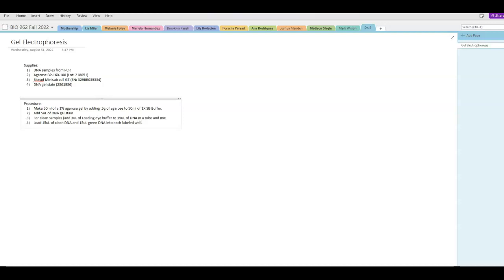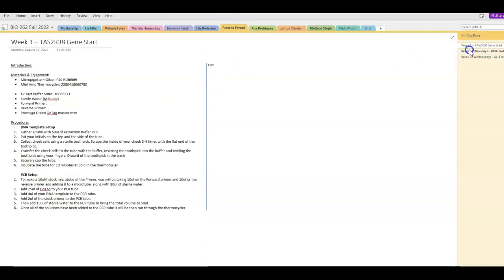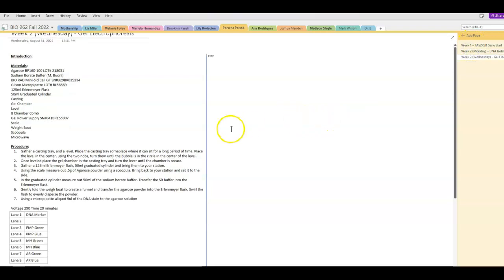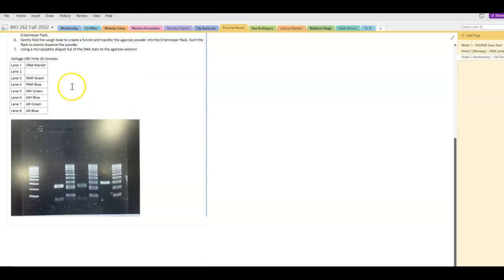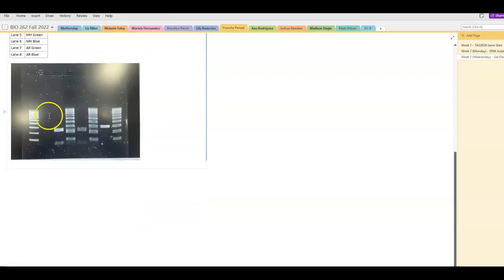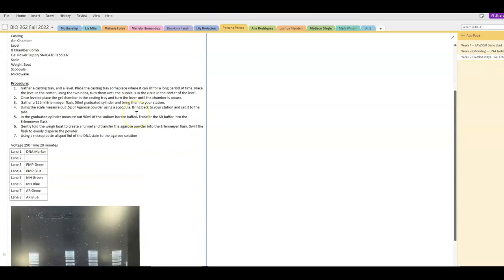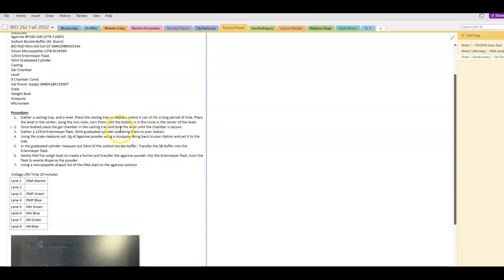What I'm then going to do is show you what I could do from there. I'm going to use Portia. Portia already went ahead here and had all of her stuff in order and did this today. So you can see that Portia not only went into way more detail than I did, and that's totally fine, I wanted to show you the minimum. But you can see here that all the lanes are figured out. Voltage 290 for 20 minutes. What's in each lane? She already pulled up a picture. She took a picture off the screen of the gel. So this is what I would expect. Something like this is really, really good. I should be able to follow what you did.